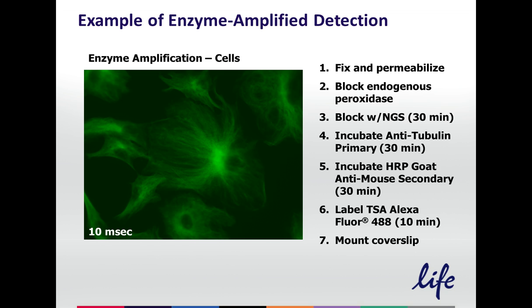Here's an example on cells. Notice the exposure time now is only 10 milliseconds, so very bright. You see on the right-hand side a much longer protocol now. You have your primary, your secondary, and your TSA amplification. Sometimes you can combine methods, which will make it even longer.